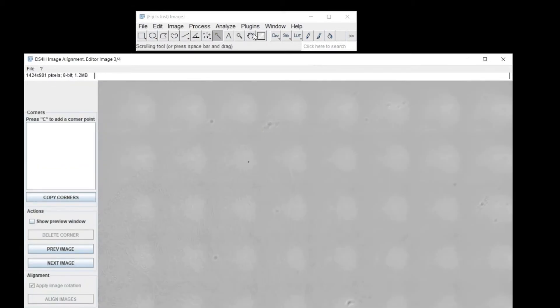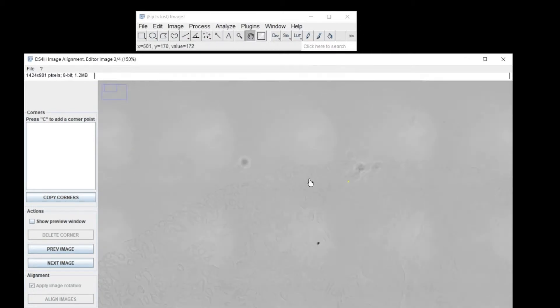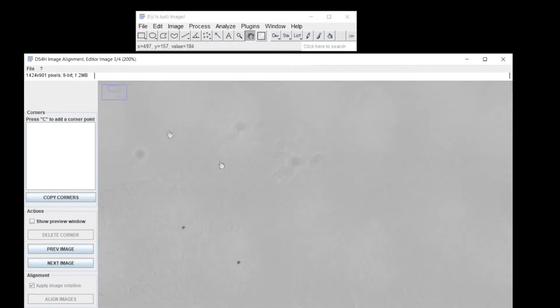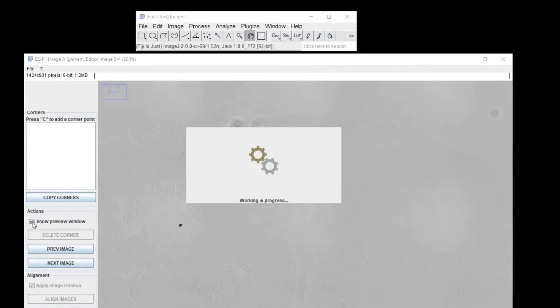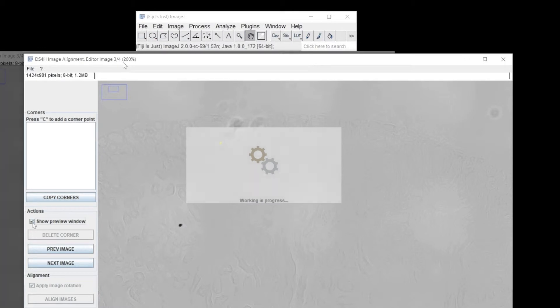If in some images it's really difficult to recognize the same points you defined in the others, use the Show Preview window and try to visually align the images using the same magnification.